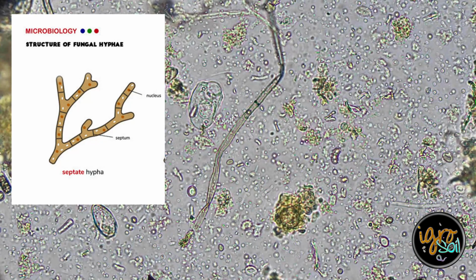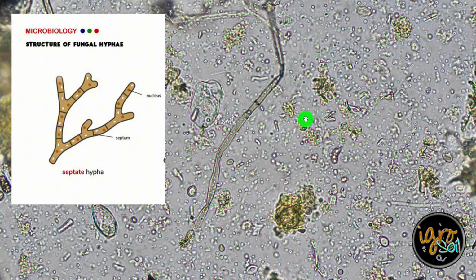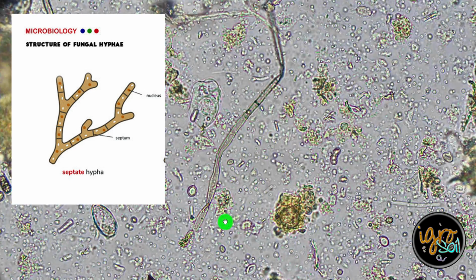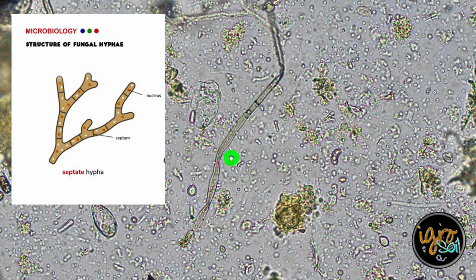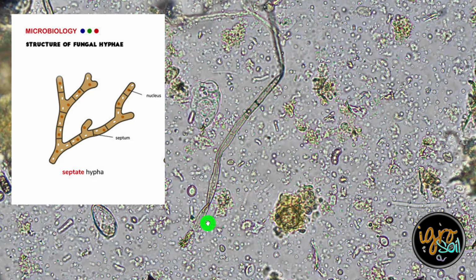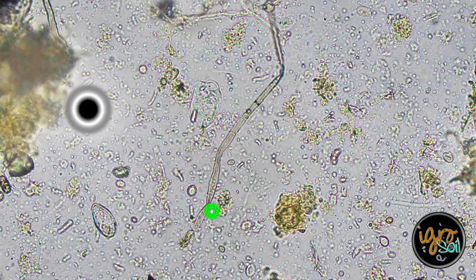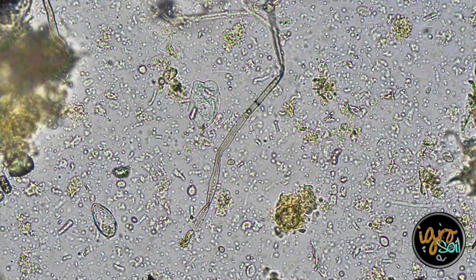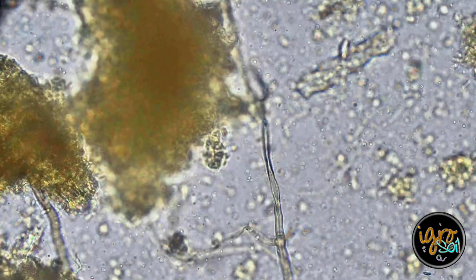That is hyphae. This is what everybody's always looking for in your compost, in your soil. There's your clear septa there. They're very uniform in width. Here, because it got crushed, you can actually see it twisted. It also got crushed there. So you just got to keep those things in consideration when you've got things under the microscope.